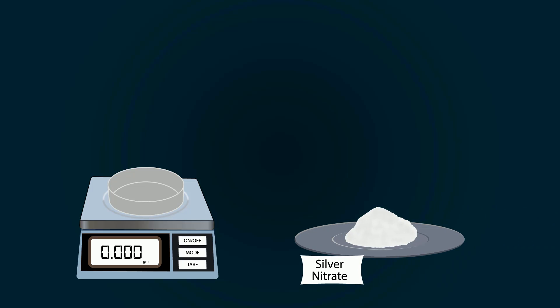Now add silver nitrate into the petri dish. We have to measure it up to 1.6987 grams.